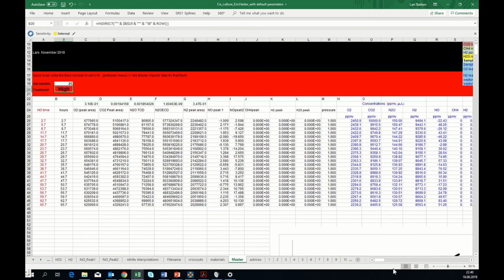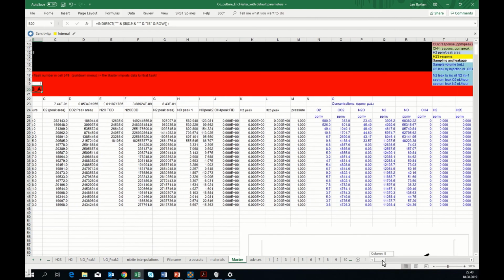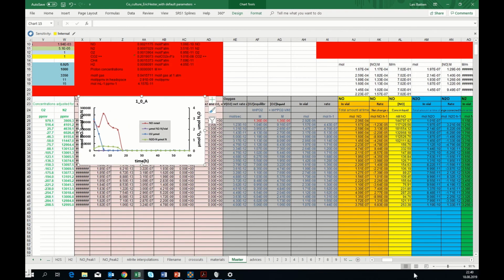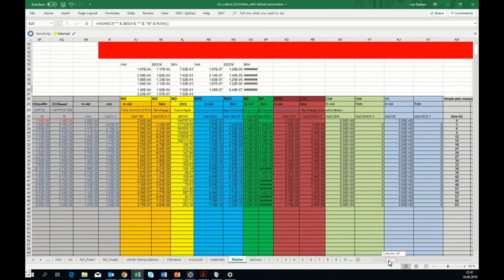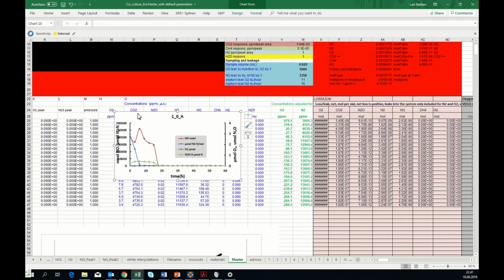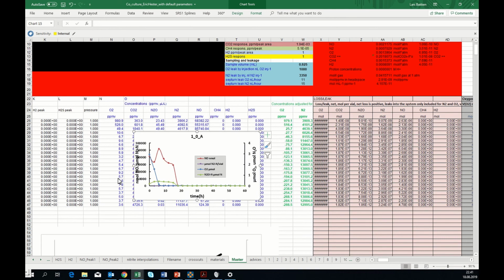So now we are ready to look at the experimental data, so we can start with vial number 1, which is an experiment with Flavobacterium, and I've already prepared a graph over here which is taking the data of, as I showed in the previous video, the simple plot. It's the measured amounts, but it's accumulated into production. But it's not plotted here. Yes, it's accumulated N2, but this doesn't produce any N2. And we use this as an example to illustrate how we can possibly set the zero offset value.